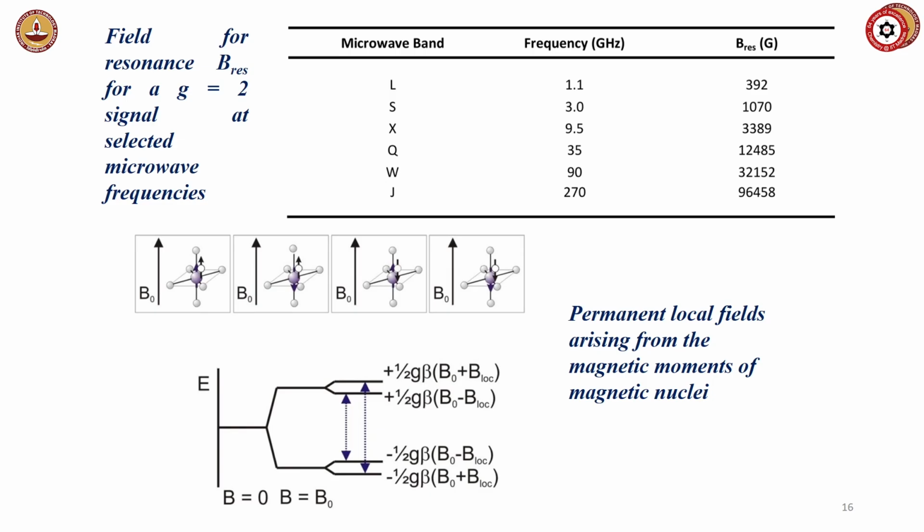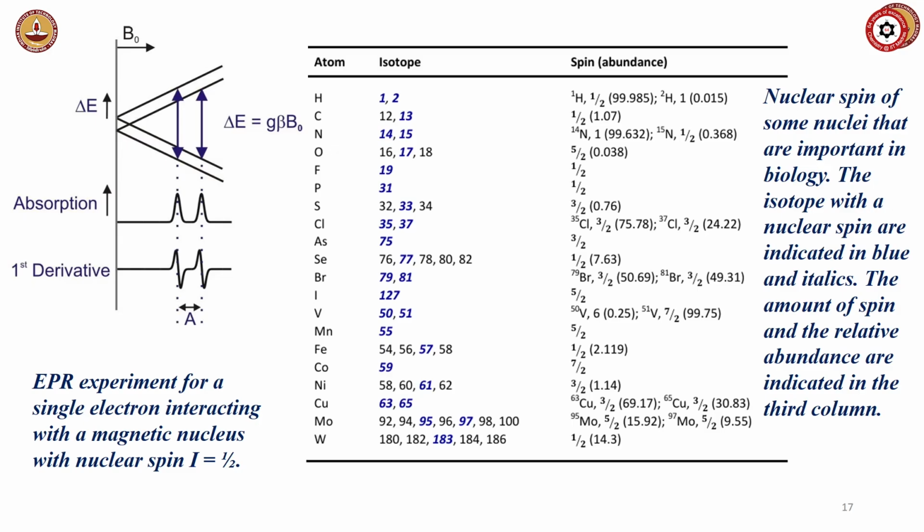The moment you have different nuclei and the electrons are there, the electrons also will couple with the nucleus, and then they will further split the electron energy levels coupled with the nuclear energy levels, and further lines are coming, what I was talking about. Now the transitions will start between them, applying the selection rule. So instead of one signal, you are getting two, the transition can be between these two or these two, and you get these two signals.